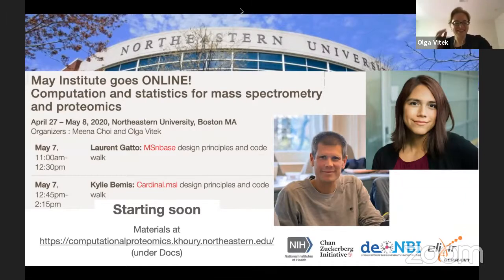Okay, hello everybody. I would like to welcome you back to May Institute on Computation and Statistics for Mass Spectrometry and Proteomics. Today we are focusing on R-based tools designed for mass spectrometry, and we're specifically looking a little bit under the hood and looking into the design of the software, design principles, and in particular, how we can work with raw data and how we can work with data that do not fit in computer memory.